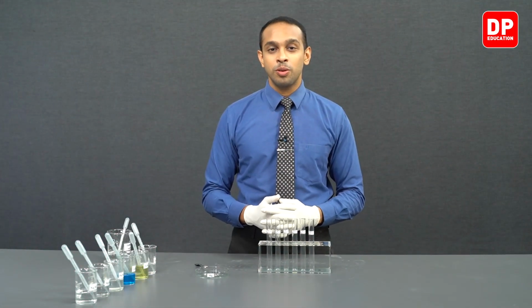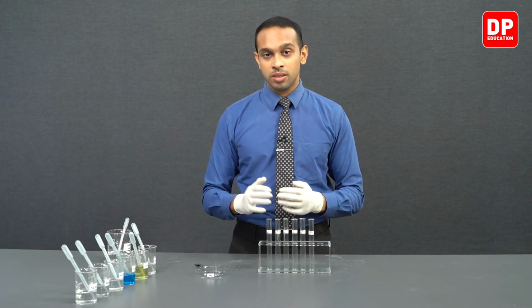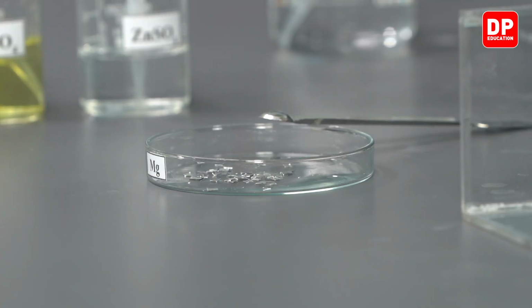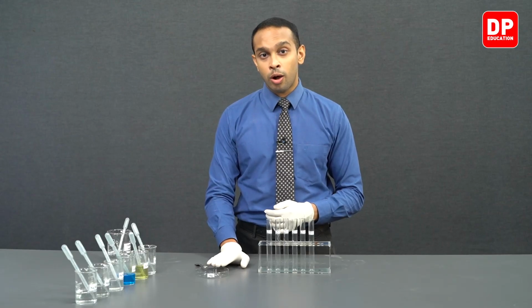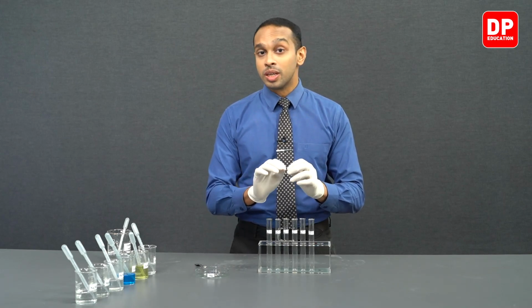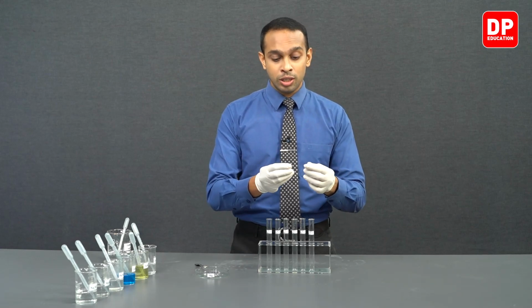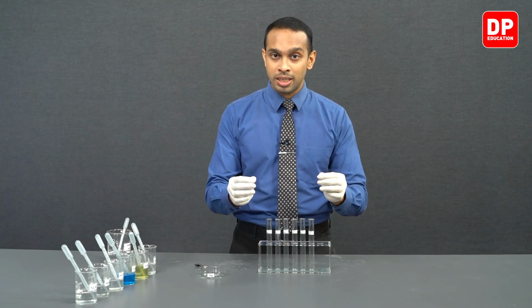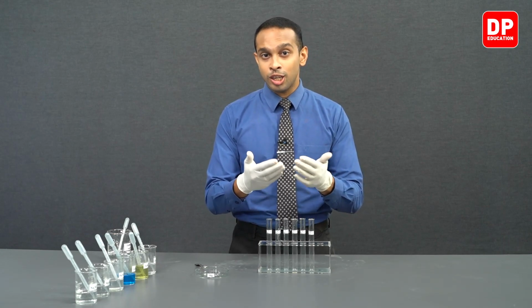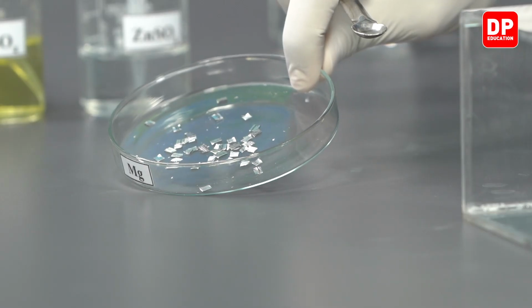Now students, we move on to the third part of our practical, where we observe how magnesium reacts with the solutions we have over here. So we have the magnesium metal pieces here. Keep in mind, whenever you take magnesium metal, you have to make sure that the outer coating of the magnesium strip is cleaned. After we observe that the outer coating is cleaned, you will see that the magnesium metal is a shiny metal. Otherwise, if you take a magnesium strip, it is going to look dull and gray in color. But after you remove the outer coating, the magnesium metal should look shiny like this.